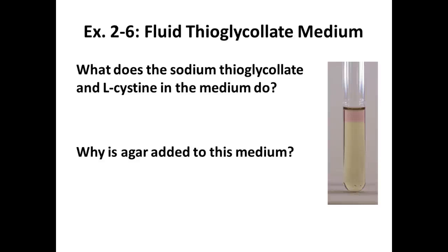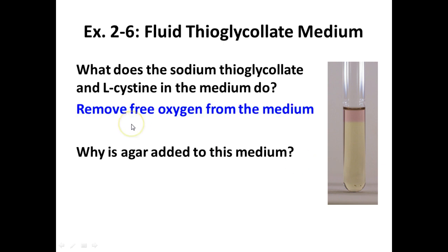You said it. Reduces oxygen, right? So we're actually creating an oxygen-free environment in the bottom of this tube, right? So we're removing free oxygen from the media. There was a little bit of agar in our tubes too, right? So if you had a lot of experience with inoculating broth cultures as versus this culture, you may have felt a little bit of a difference.